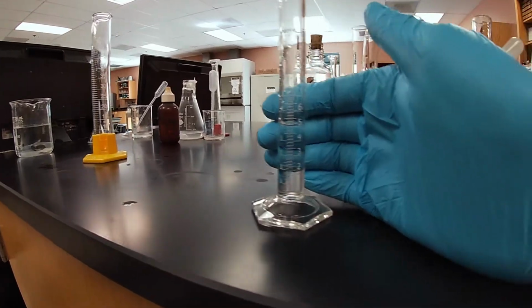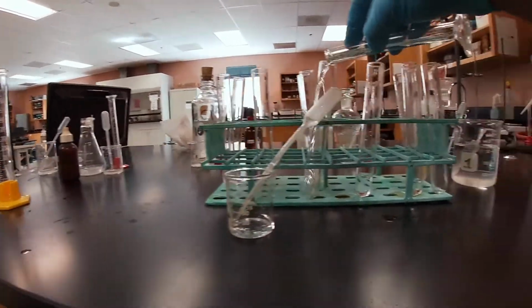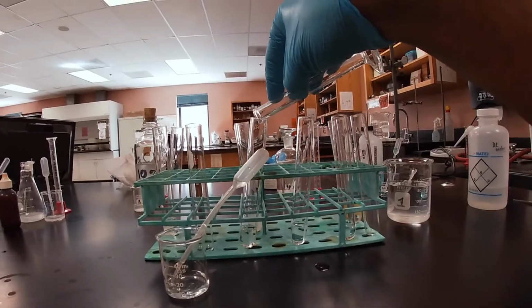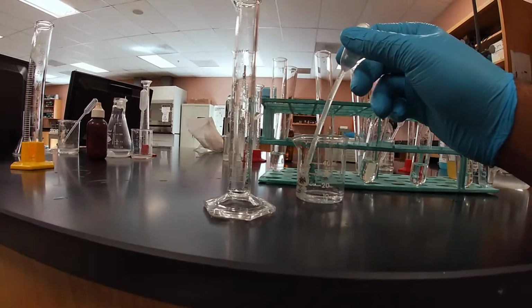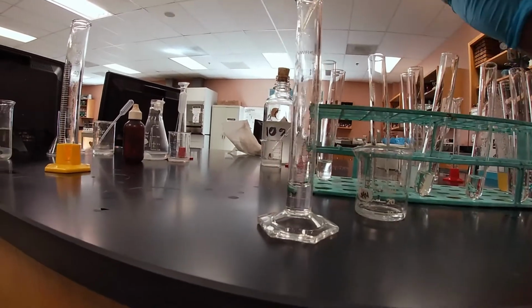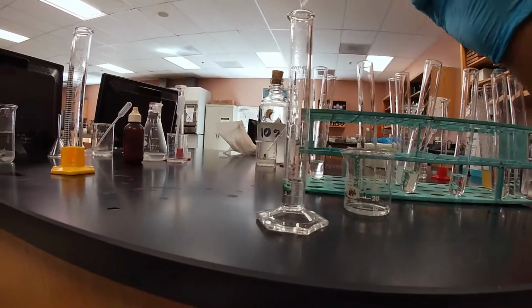Again, the three tests, right? So we're gonna go ahead and add our contents to our test tube. And then we're gonna go to the next one and make our final addition. We're gonna add our 3 tests, hopefully.